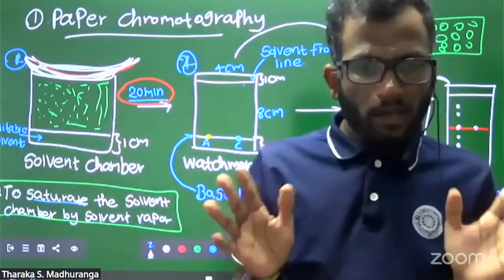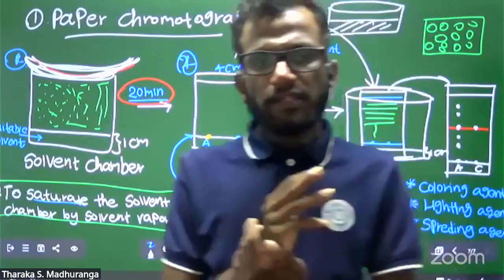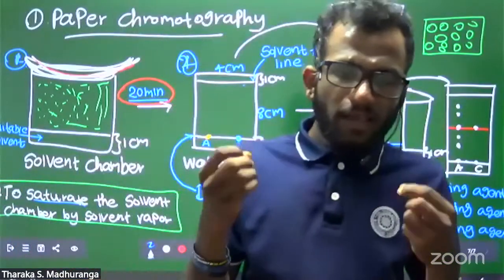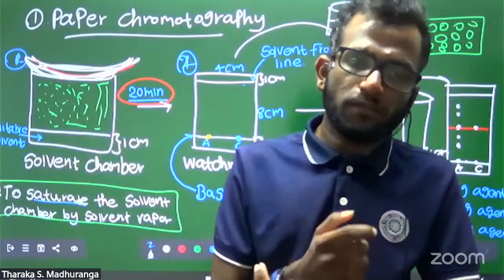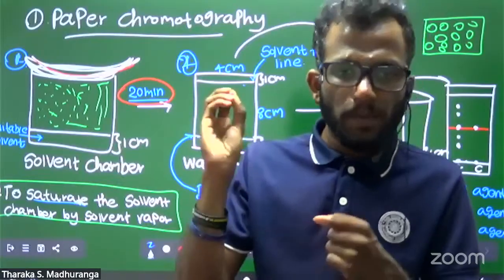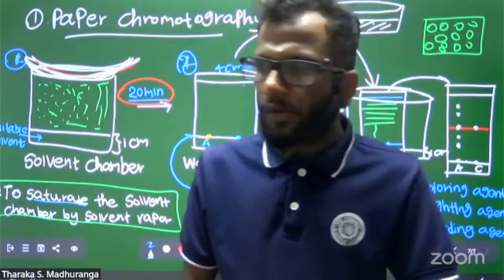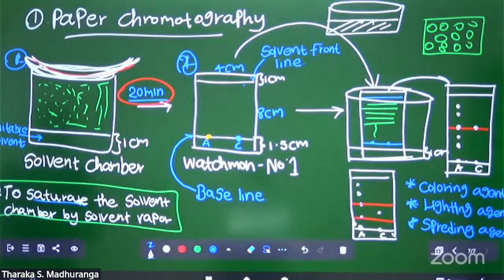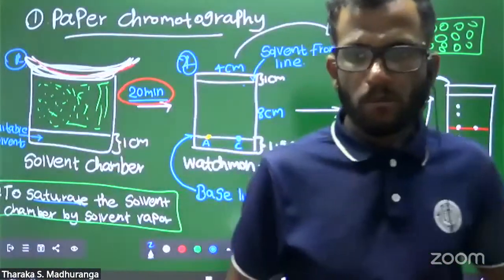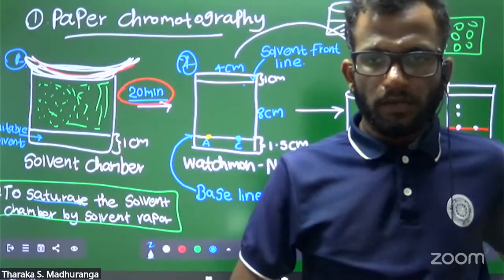If you can understand this paper chromatography, don't worry about the other chromatography types. They are very simple. If you understand the basic concept and the basic steps of paper chromatography, the other ones are very, very simple. Any doubt in paper chromatography?